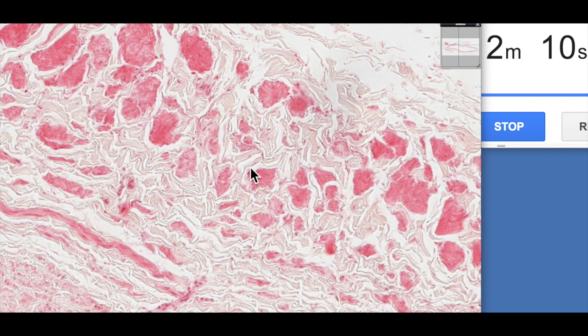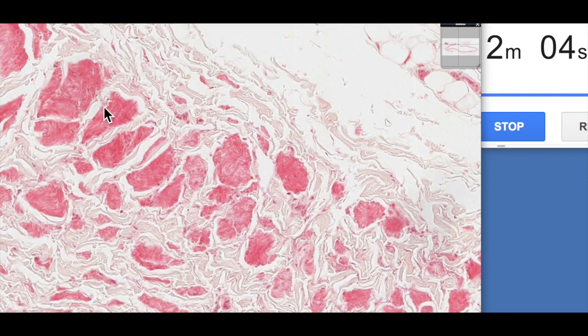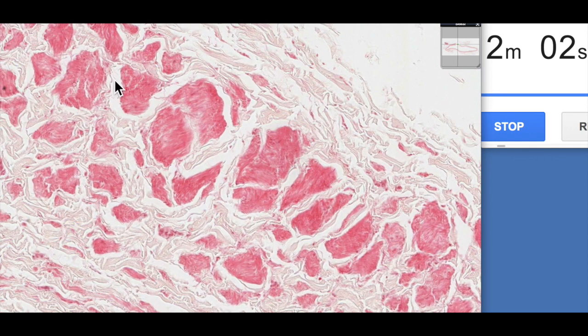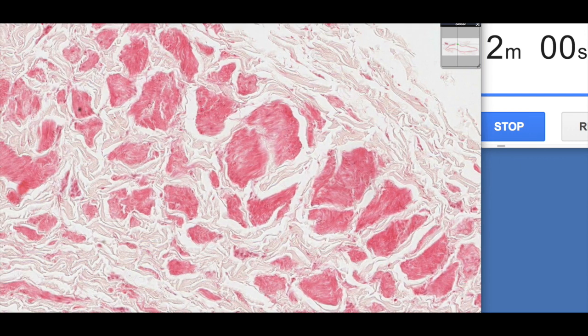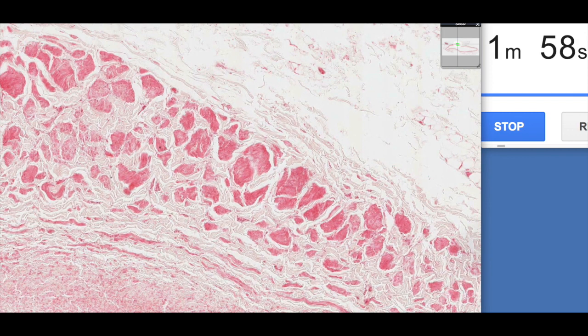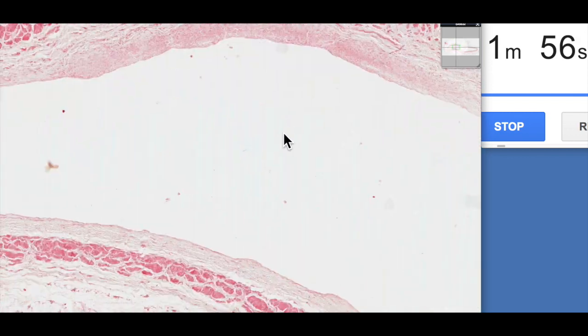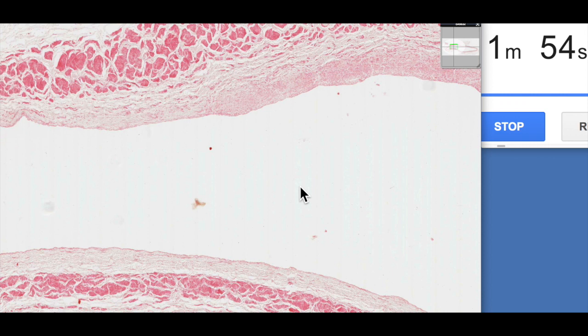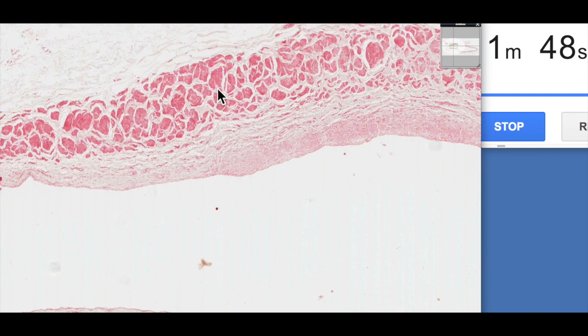Most of our blood vessels have their smooth muscle within the tunica media but the vena cava has it in the outer tunica adventitia and it's usually longitudinally arranged. The reason for this is that the blood pressure within the vena cava is really low and so in order to help the blood return to the heart, we get this peristaltic contraction of this smooth muscle within the tunica adventitia.